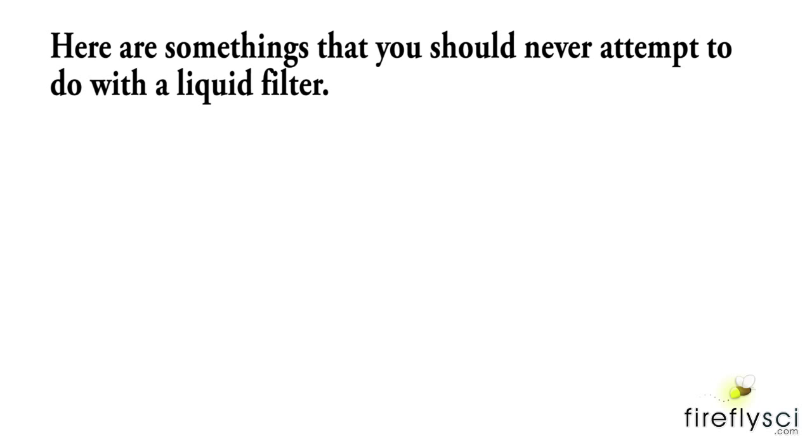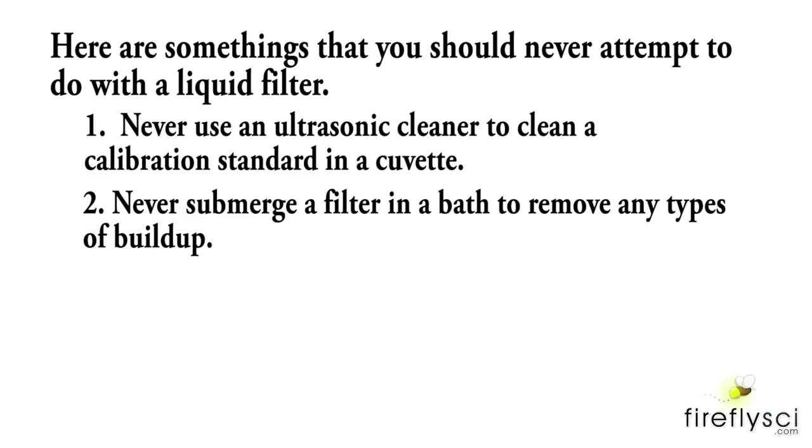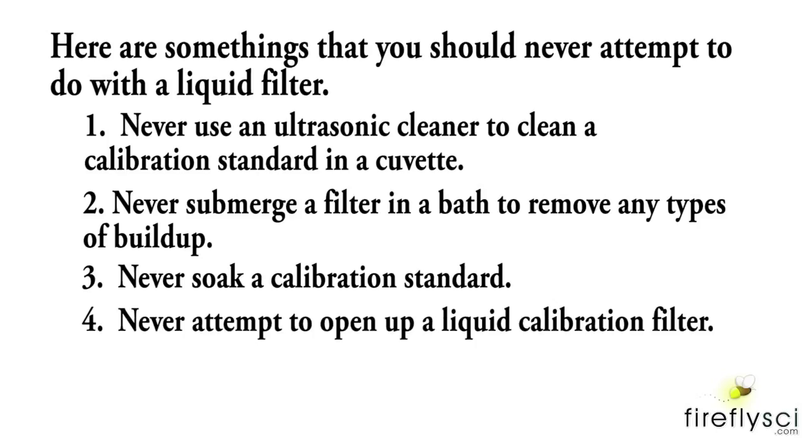Here are some things you should never attempt to do with a liquid filter. Number one: never use an ultrasonic cleaner to clean a calibration standard in a cuvette — this can make the cuvette fall apart. Number two: never submerge a filter in a bath to remove any types of build-up. Number three: never soak a calibration standard. Number four: never attempt to open up a liquid calibration filter, as these can contain some pretty dangerous chemicals.